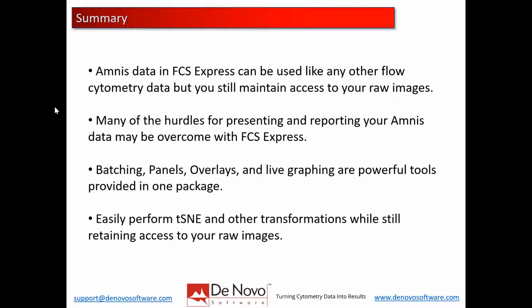Importantly, Amnis data and FCS Express can be used like any other flow cytometry data, but you maintain access to your raw images. You don't have to export from IDEA software out to FCS files. You can use the native DAF and CIF files that are there. What that will allow you to do is skip many of the hurdles for presenting and reporting your Amnis data that you have in IDEA software. So if you need to simply create an overlay, if you need to get a figure ready for publication, all those things are very quick and easy to do in the software.